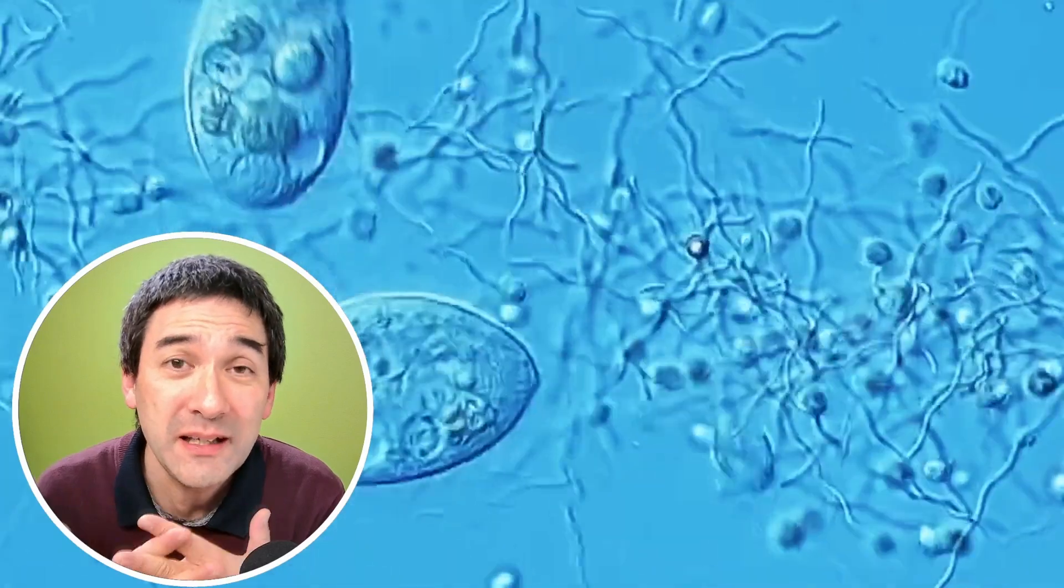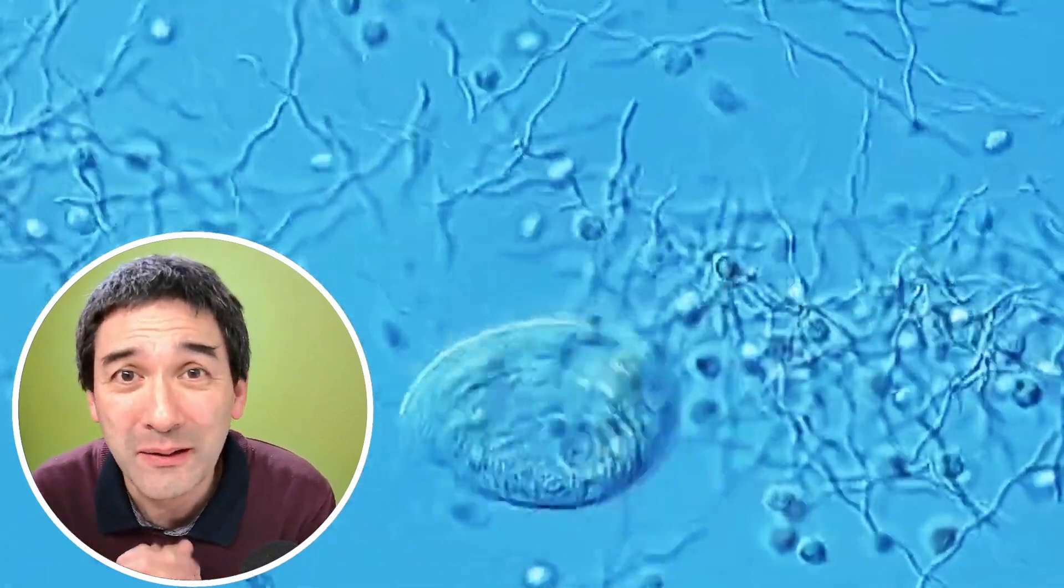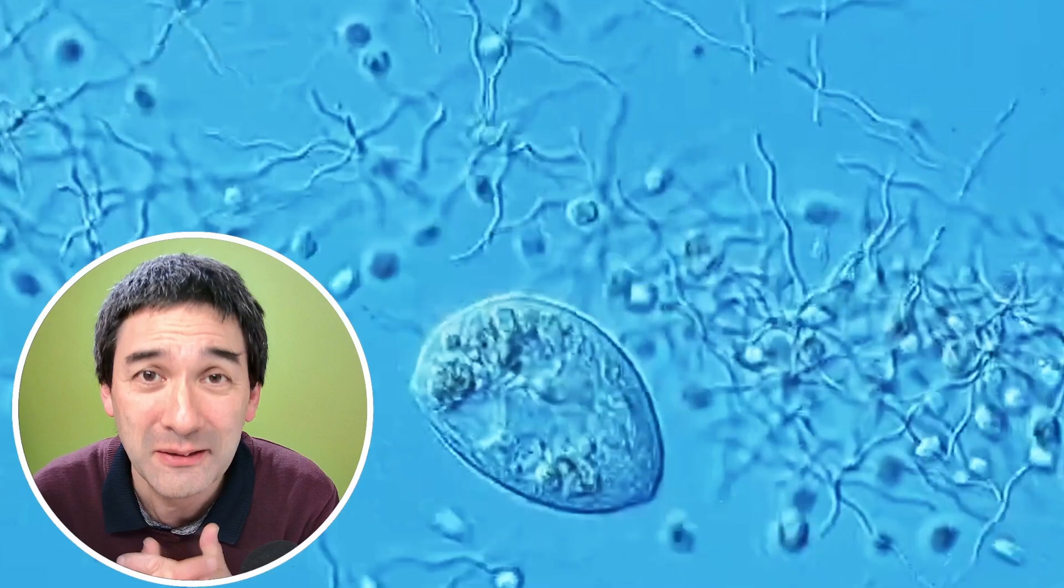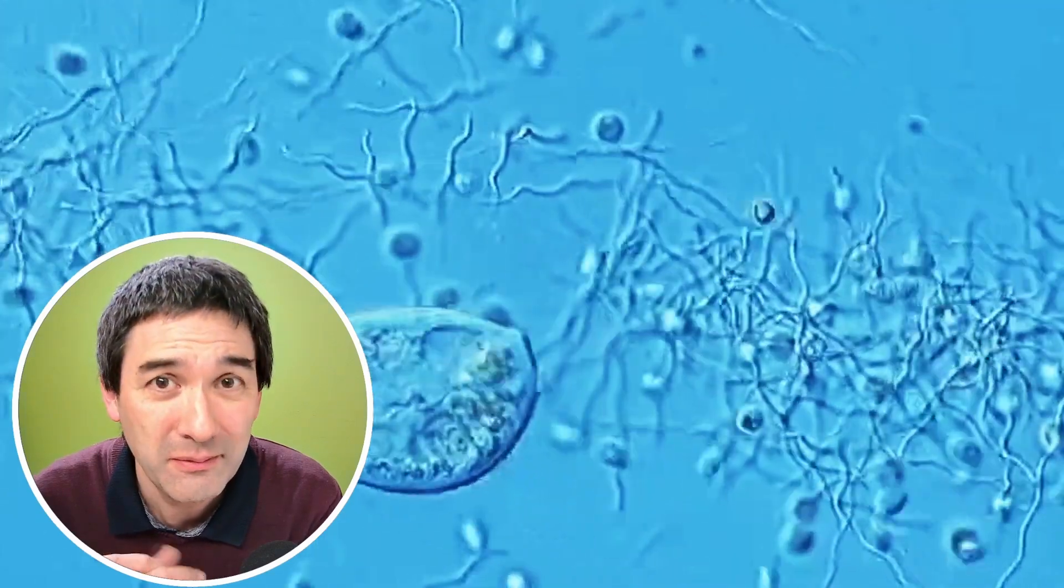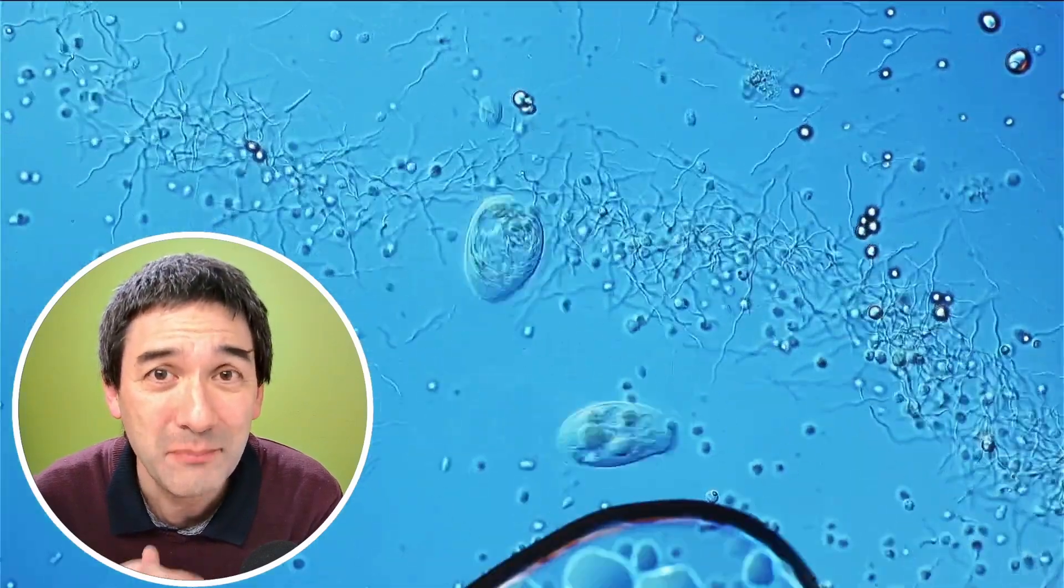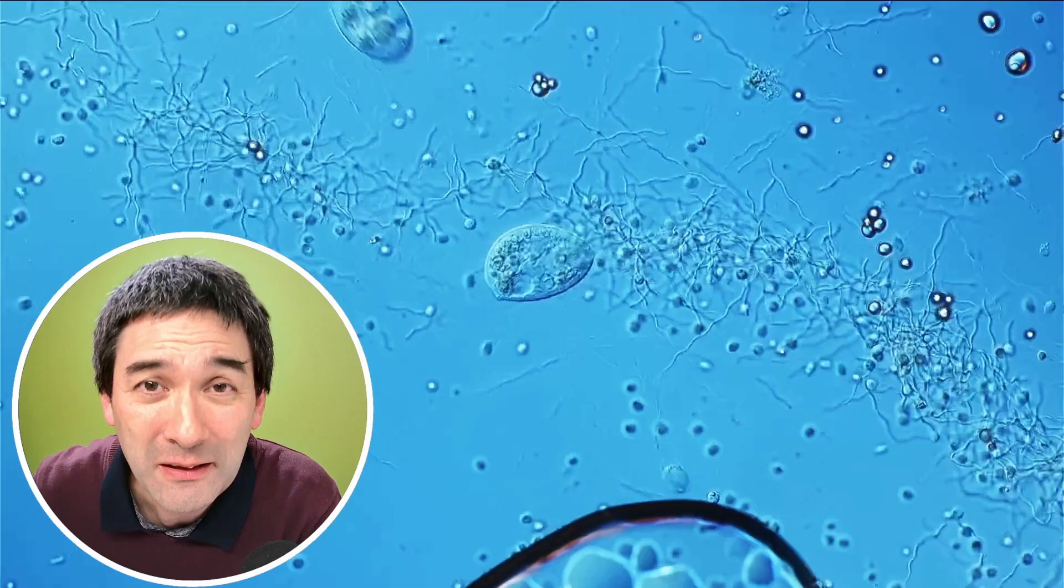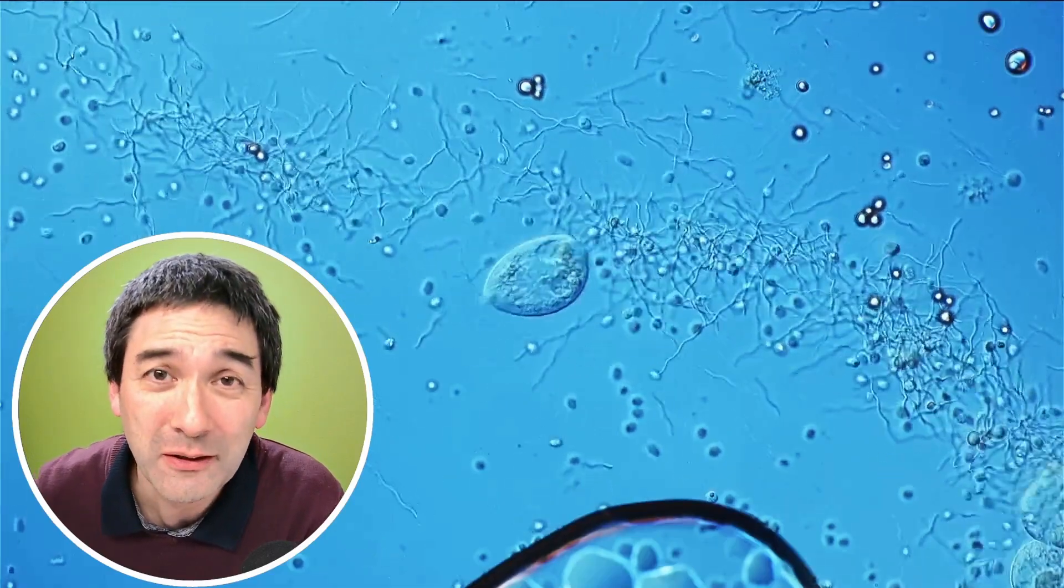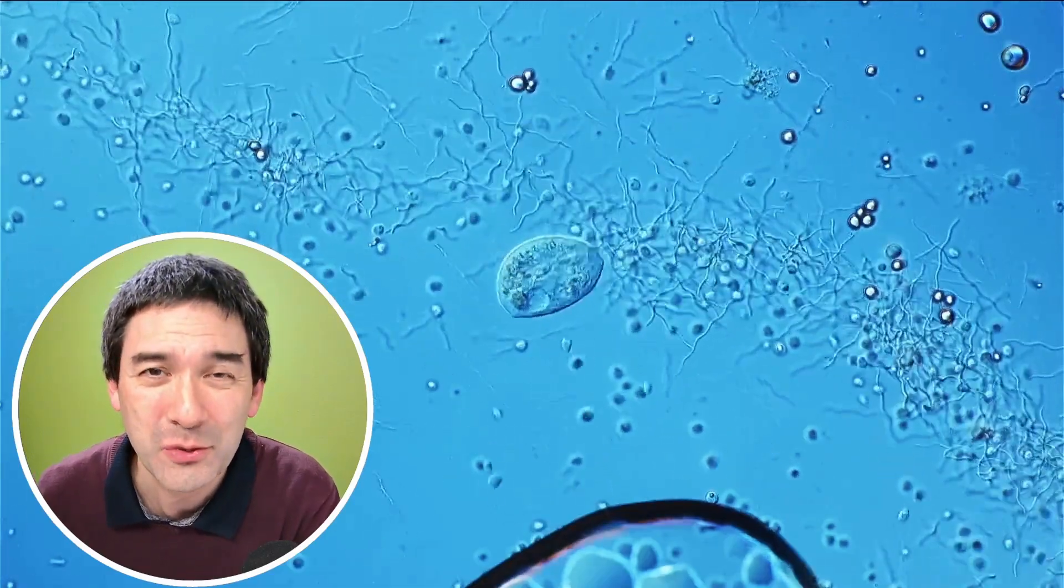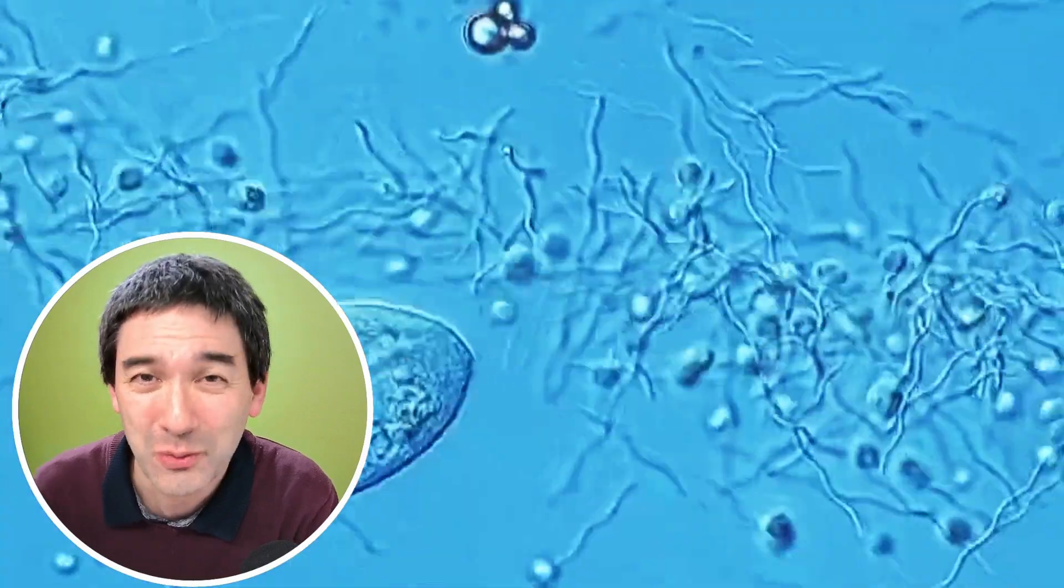Well, in any case, I was happy that I was able to find those little critters here. And essentially, yes, it reminds me again, you have to be a little bit patient and you have to have a little bit of luck when you're putting things under the microscope, because occasionally you can find a few interesting things here as well.